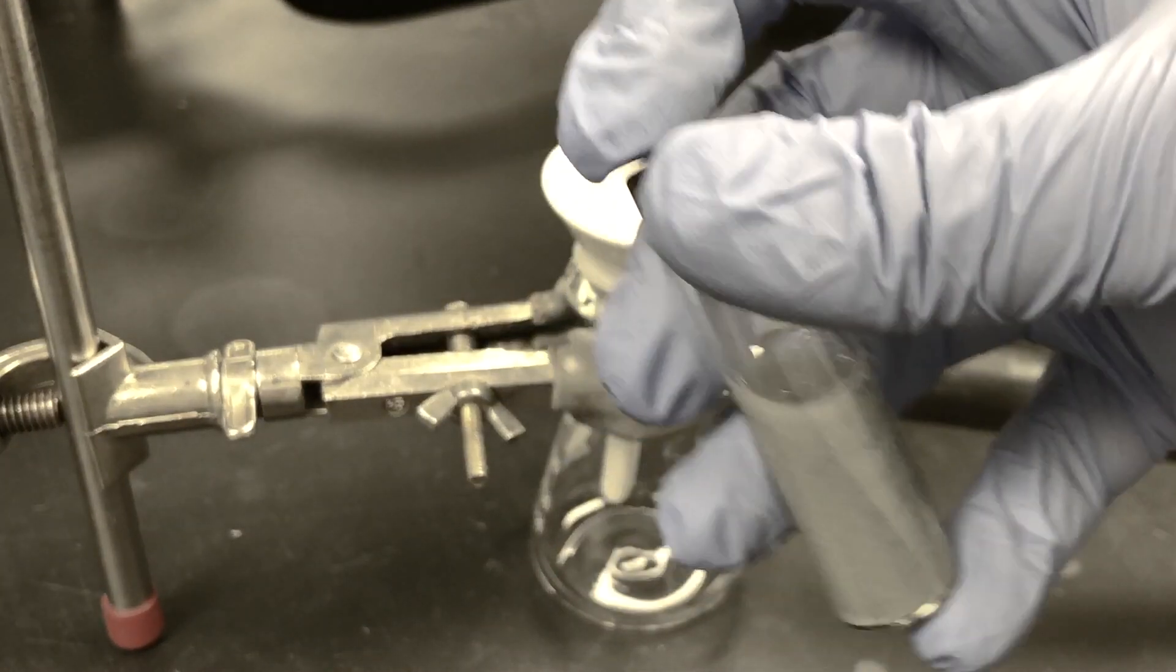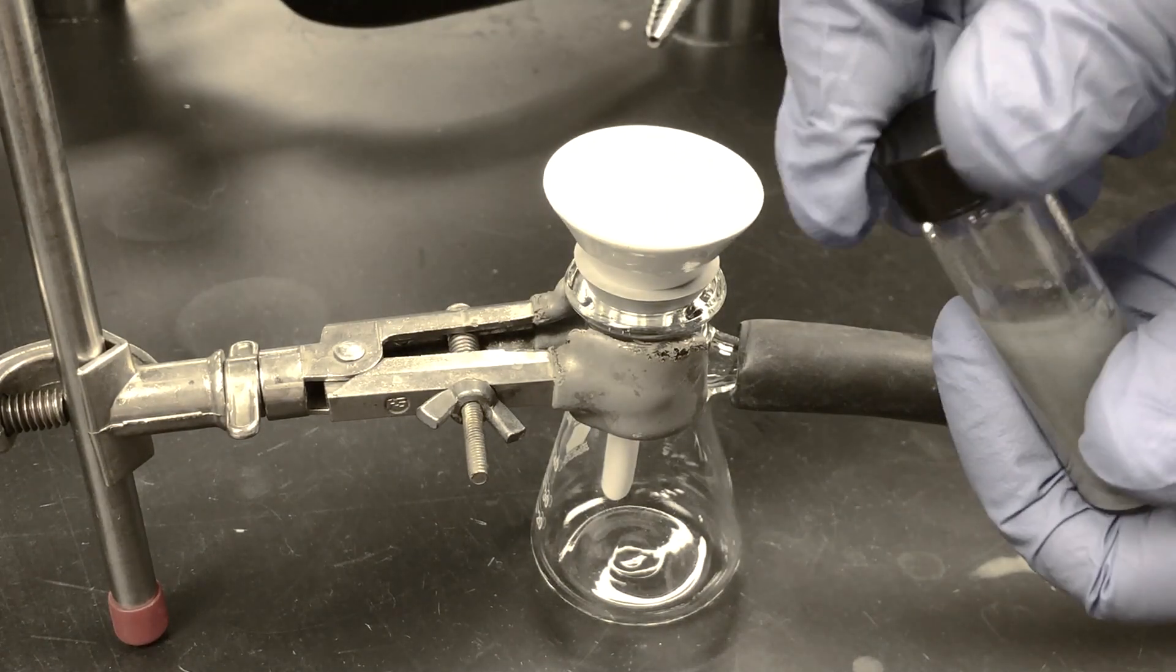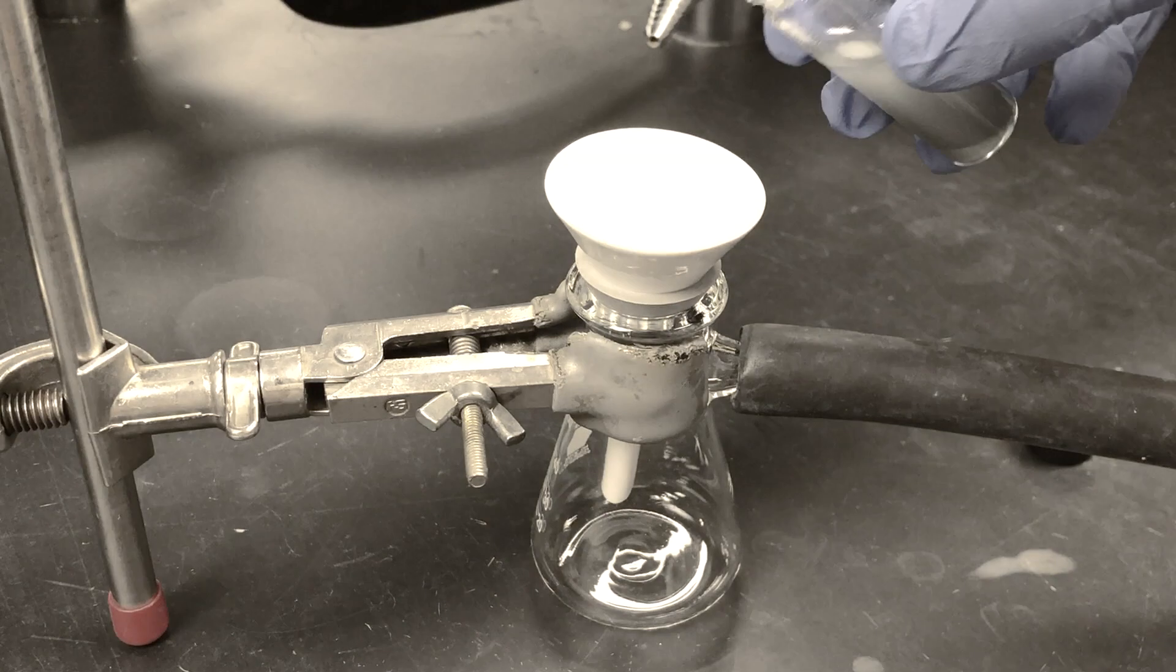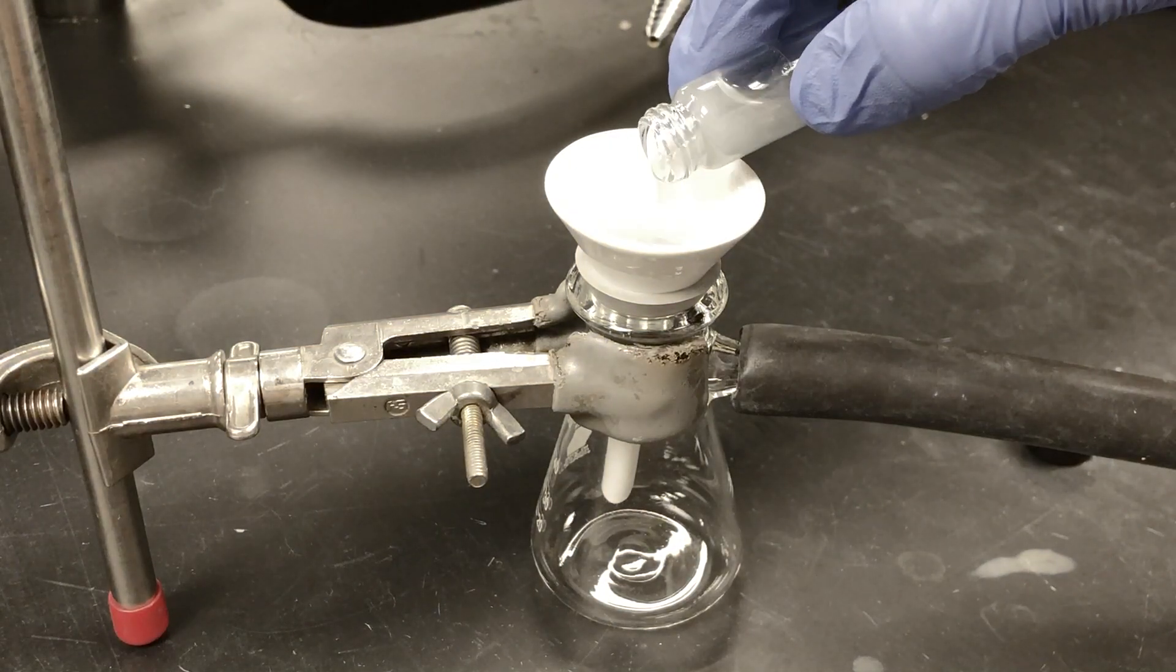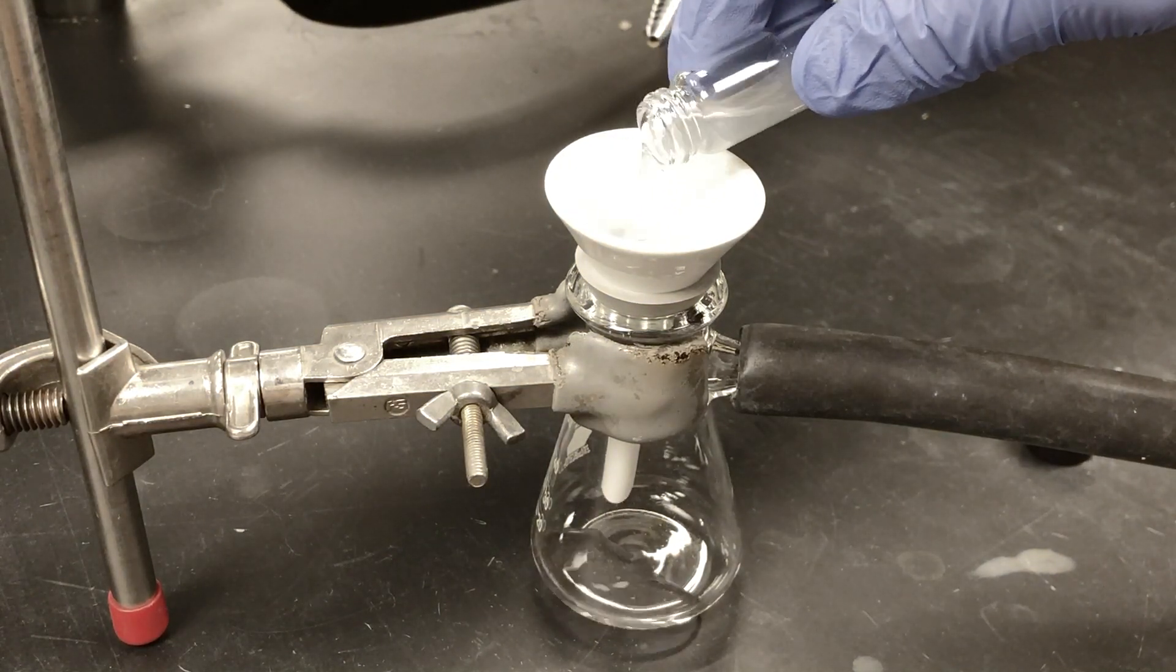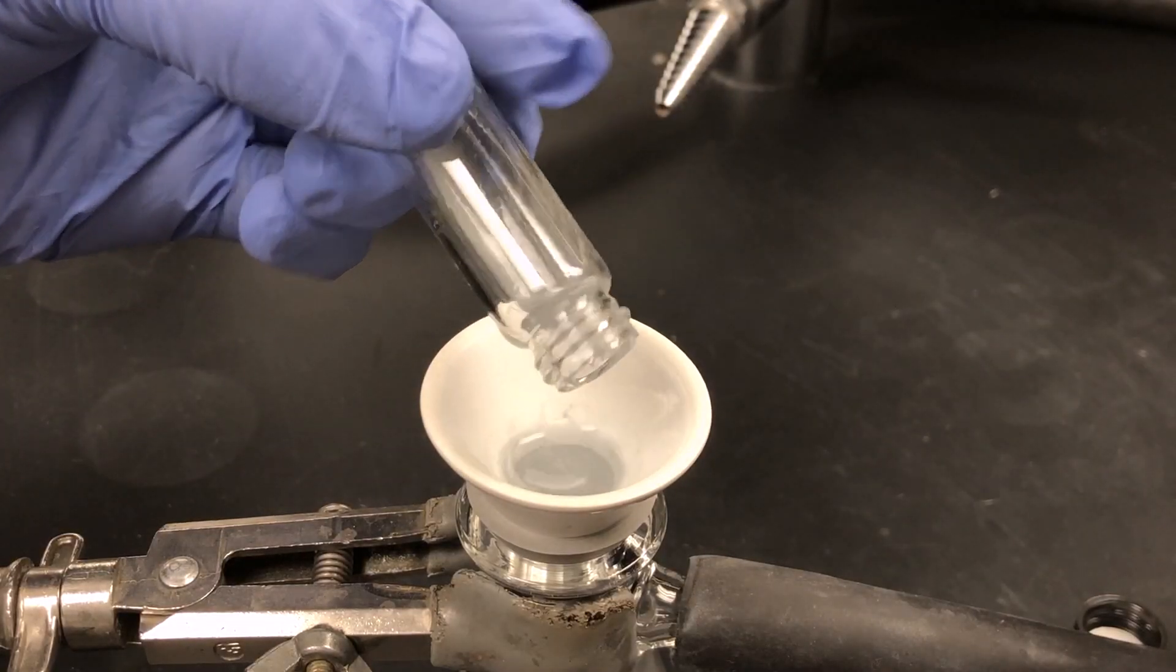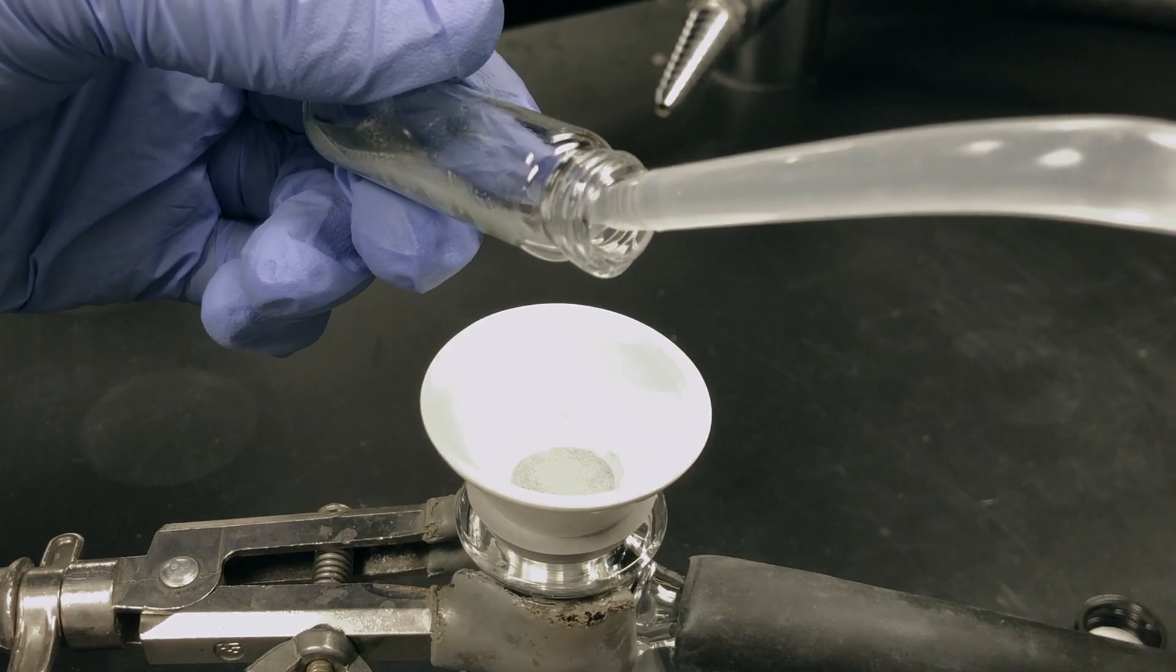Now you can start adding your solution. Shake your vial first, and then pour the contents onto the center of the filter paper. Try to get as much of your solid onto the filter paper as you can. You can rinse your container with your solvent a few times to remove any residual particles.